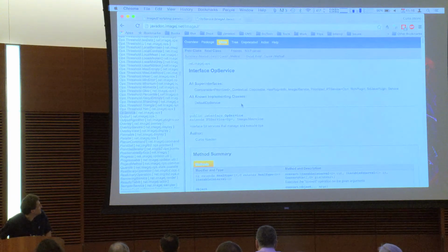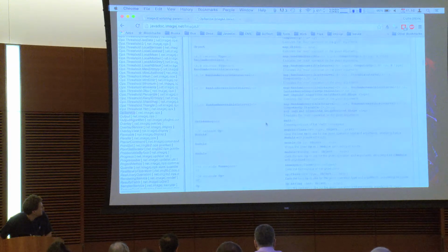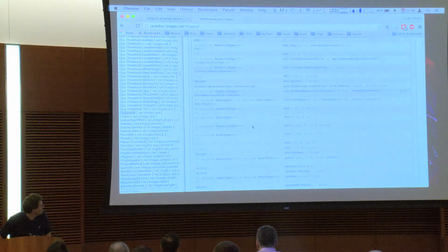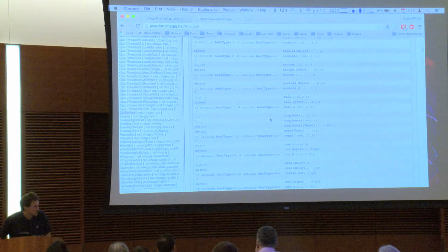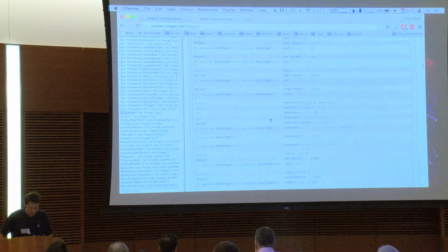There's a few ops that are in the global namespace. These are ones that are really general, but most of them look like this. So for math, you say op.math, and then it's in here, and you can look through the list of all the math ops. So for example, if what you know is I want to do some math operation, but I don't know what it's called or what the arguments are, they're all listed here, but that's really long to browse through.